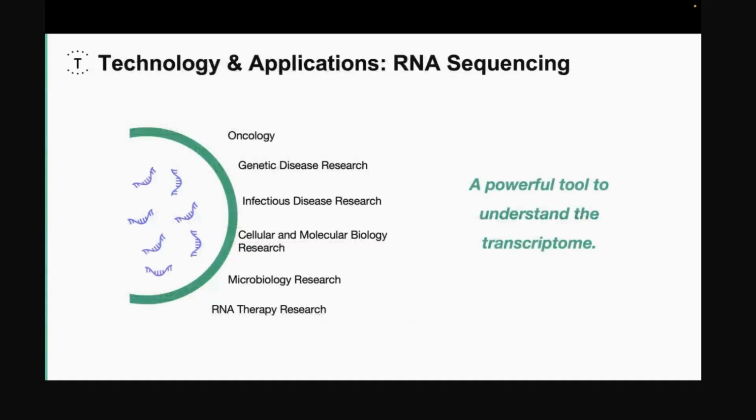So RNA sequencing has already been trendy in multiple applications, which started from oncology and has now expanded to RNA therapy research. There are multiple aspects of RNA sequencing currently used, not only in the oncology field, but also in infectious diseases research, for example, creating antibodies for SARS-CoV-2, and also in microbiology research. In a nutshell, RNA sequencing is a powerful tool to understand the transcriptome.